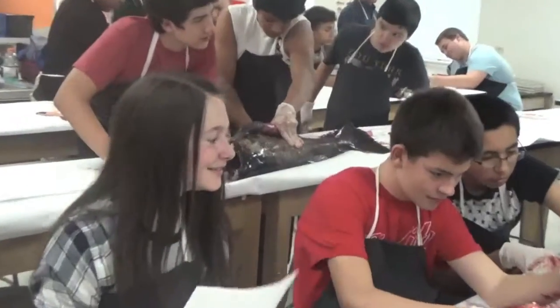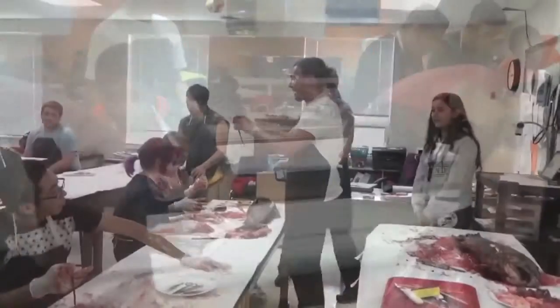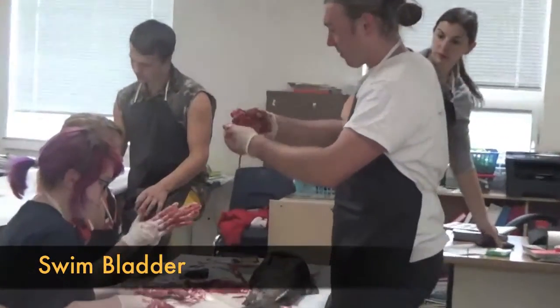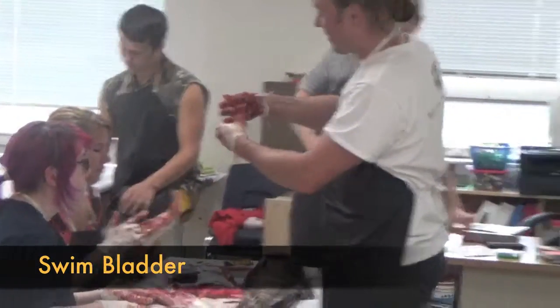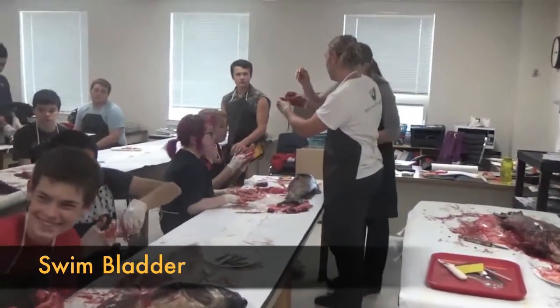Where is the heart closest to? The gills. That makes sense — our hearts are close to our lungs, and theirs are close to their gills. This is an example of it right here, though we may have damaged it in the process.